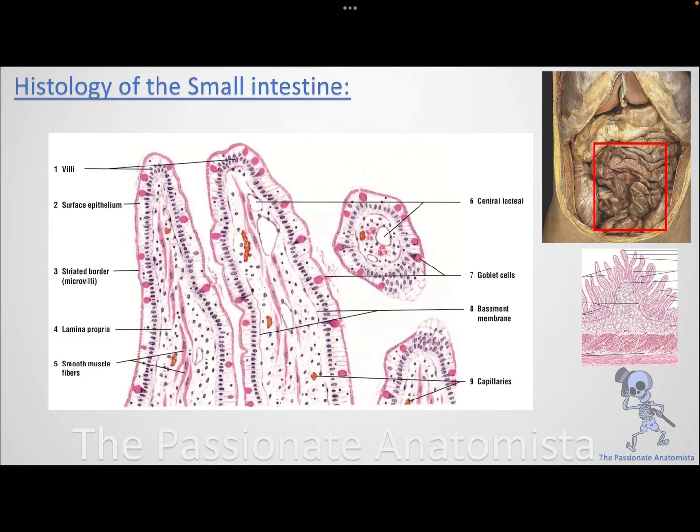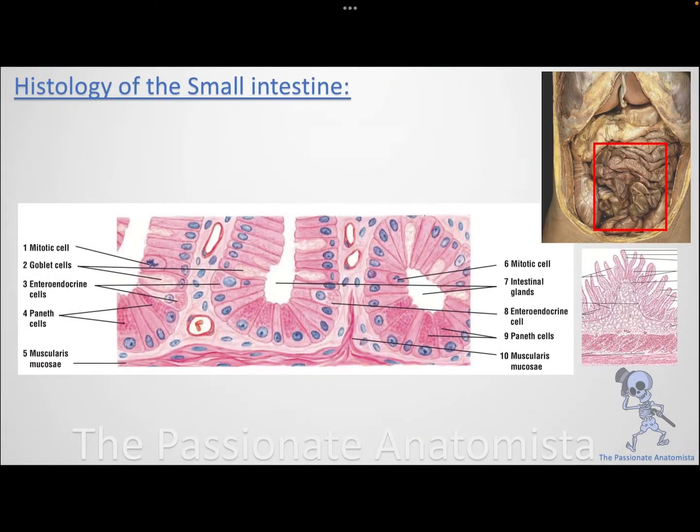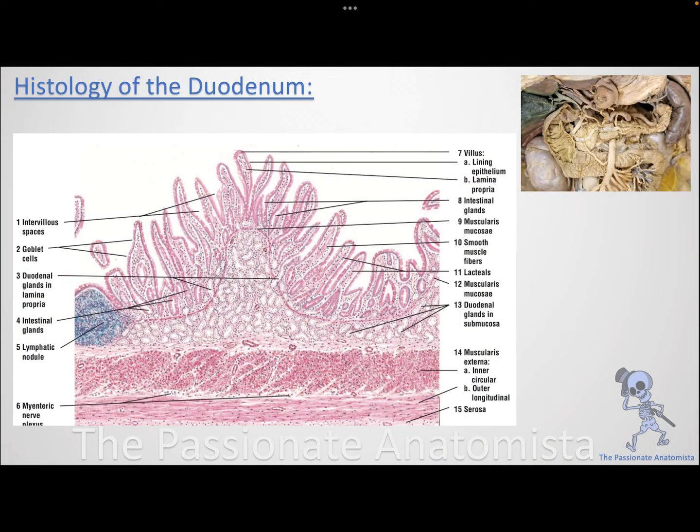Generally talking, let me show you low magnification first. If you remember, we have the submucosal folds that give you the plica circularis. If you look at the core of the huge thing, it's going to be the submucosa. This is in the core.